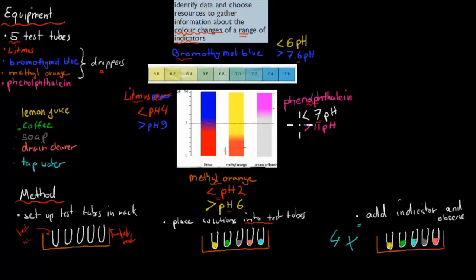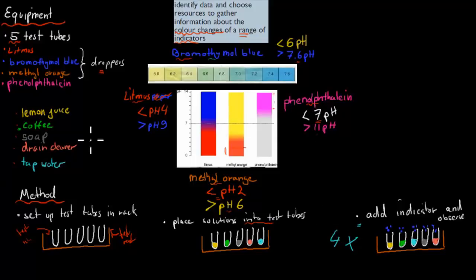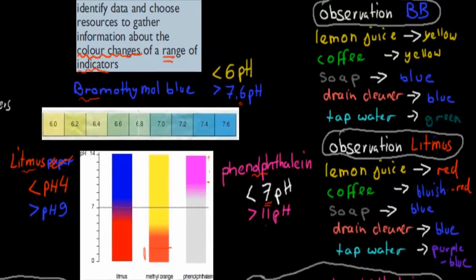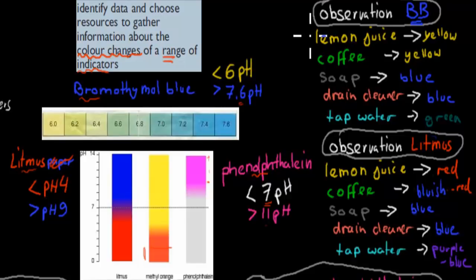Let's say we start with bromothymol blue as our first indicator. What you do is put a couple of drops of bromothymol blue into each of the test tubes and observe the color change. Using those observations, we can estimate what kind of pH it has. For lemon juice, it turned yellow with bromothymol blue. Yellow means a pH of less than 6, so we know that lemon juice has a pH of less than 6.